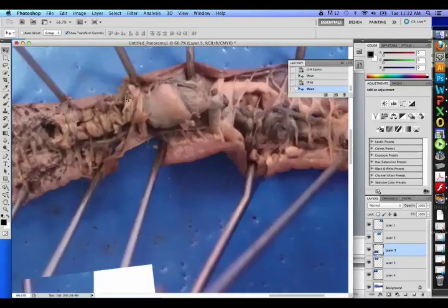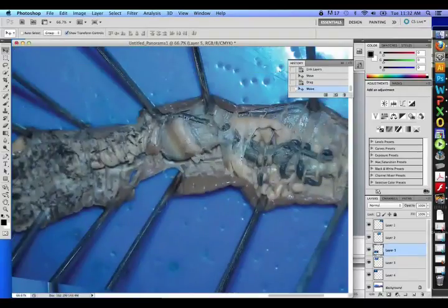Then we get to the parts I'm more concerned about, these two. We have first, this is a soft part, it's called the crop. So the C is before, the C comes first in the alphabet. So the crop is first. You can see here, these are the reproductive structures. But the crop is first, that kind of stores and holds the food, softens it up a little bit.